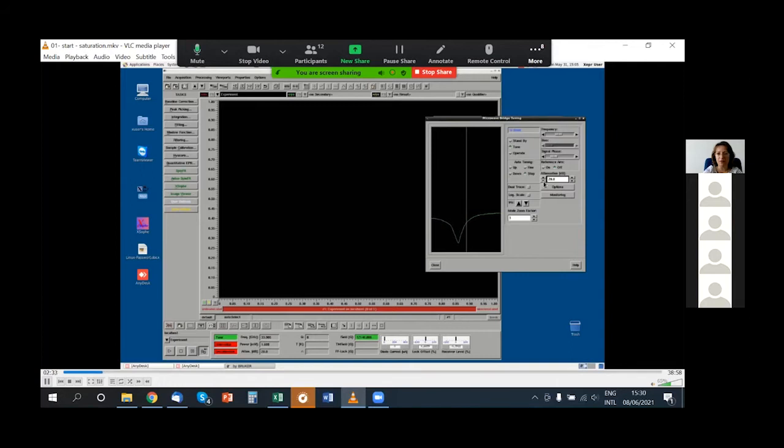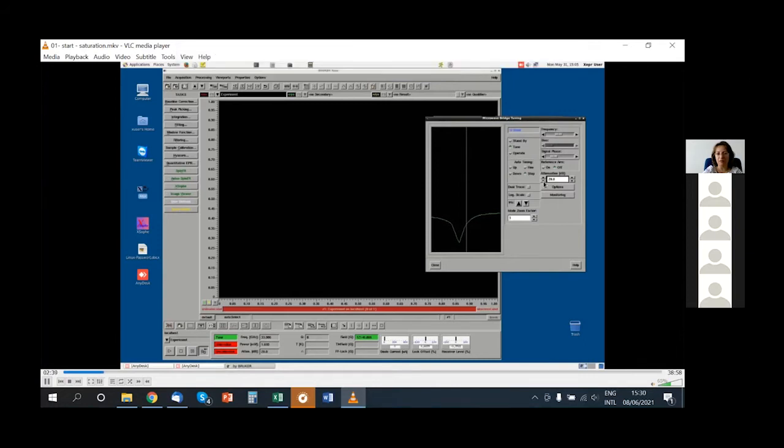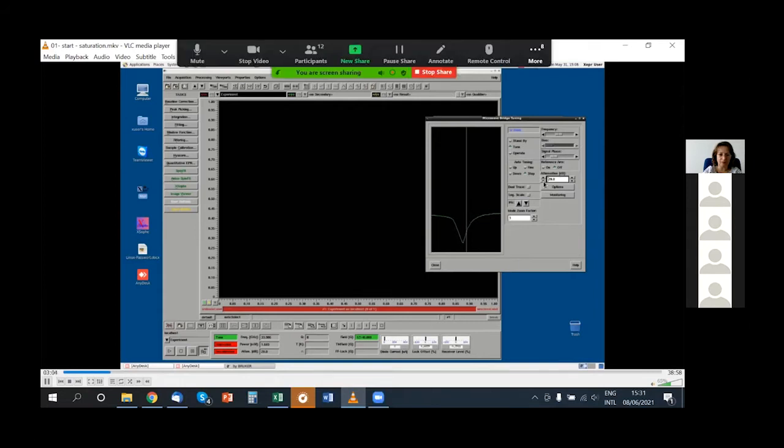So we are now at the Q-band spectrometer, and here you really start to measure one spectrum after 90 minutes from the spectrometer start. So there are a lot of procedures before recording a reliable spectrum. I will do it faster.